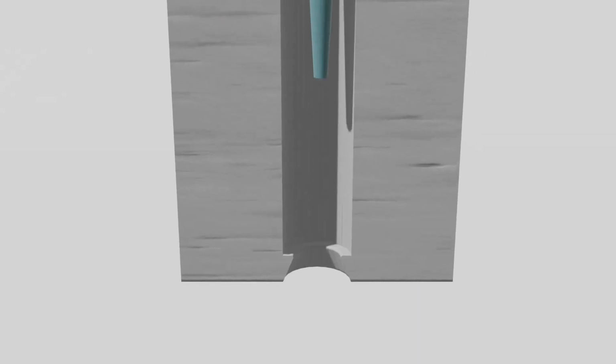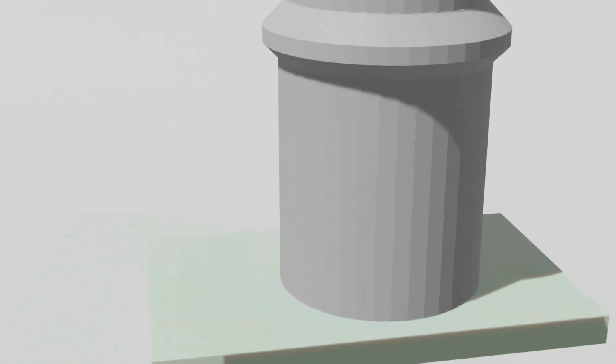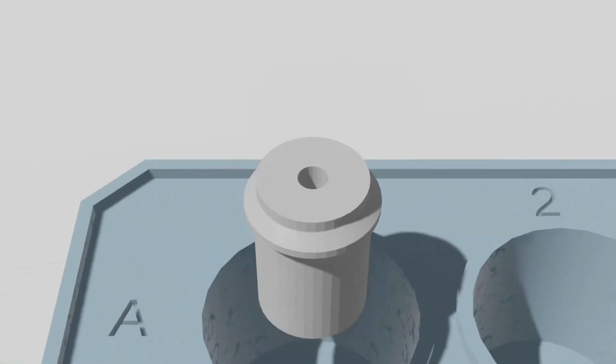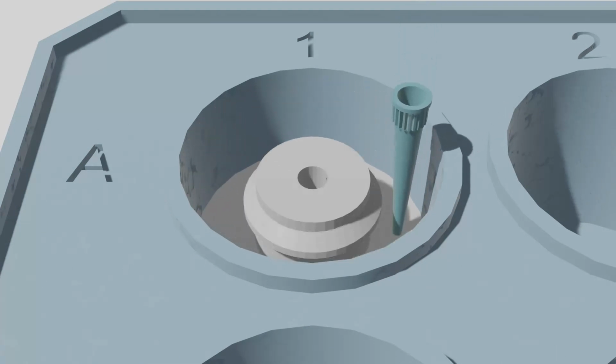Then, we pipe around 50 microliters of gelatin into the bottom of the tube and allow it to cross-link atop a glass surface in order to keep the gelatin surface as flat as possible. A solution of PBS is then added to allow it to reach a swelling equilibrium while remaining flat, in addition to keeping the gel hydrated.